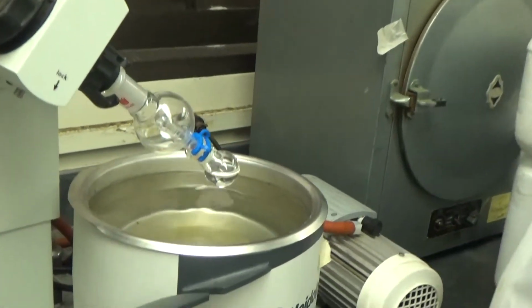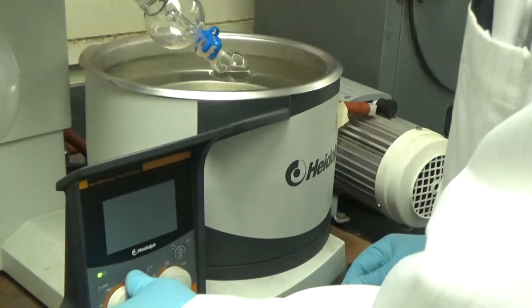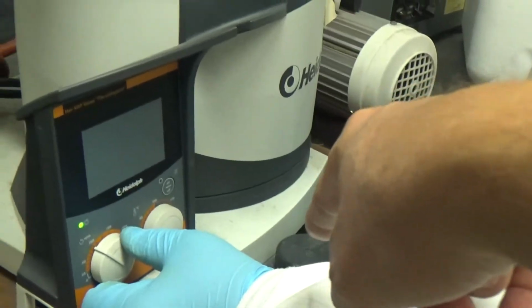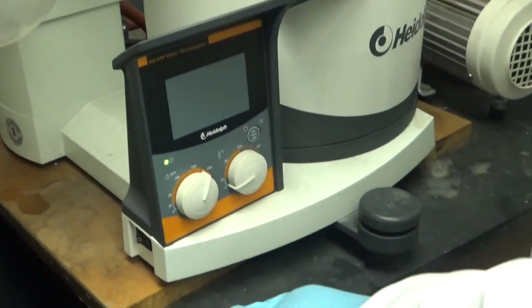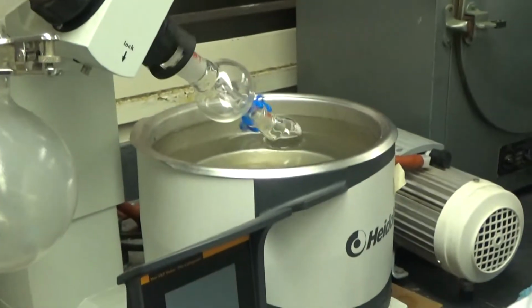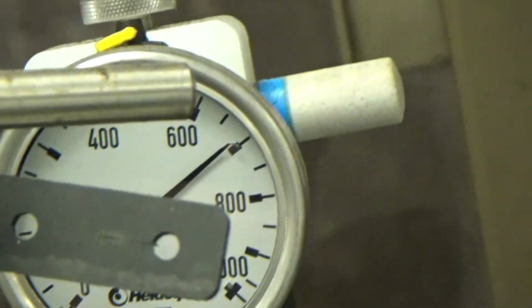Now you lower it in. You pushed that little black thing, and that allowed you to move it up and down. Okay. Start rotation. Then you turn on the vacuum. You're watching the pressure, right? The pressure has to decrease.